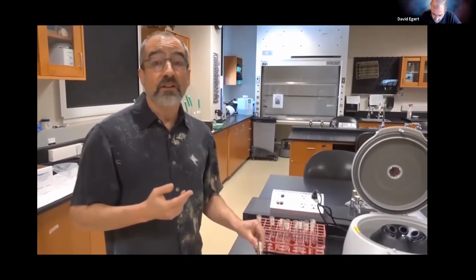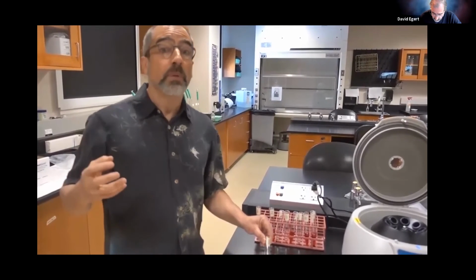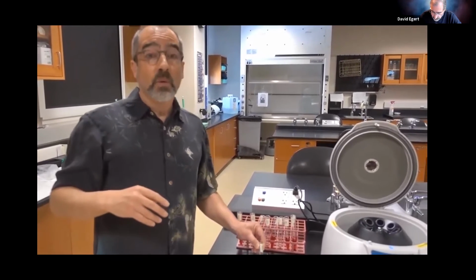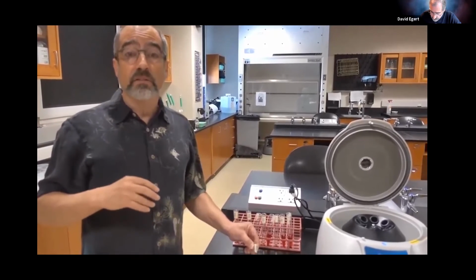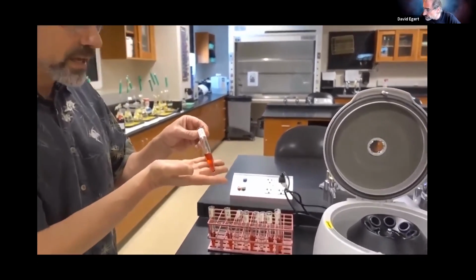As we've done this lab over the years, we actually get different results depending on the freshness of the blood. Blood that is fresher, the cells are healthier, more robust, they can actually take a slightly hypotonic solution and they're gonna puff out, but not necessarily pop. Whereas the older cells are not able to sustain that kind of increased pressure and are more likely to explode and create this hemolysis condition. So, what you get in this tube might actually depend on just how old or how healthy the blood cells are.